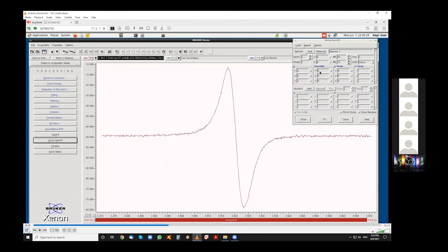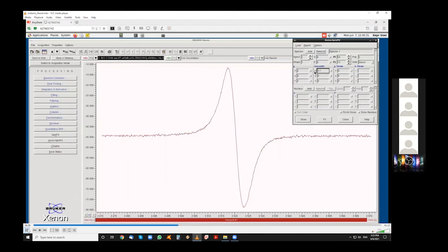And if you see some delays in the measuring process, it is because I worked remotely on this computer from the lab computer, and we still have some internet connection problems.